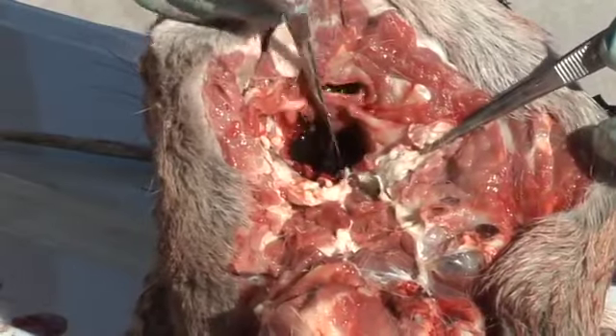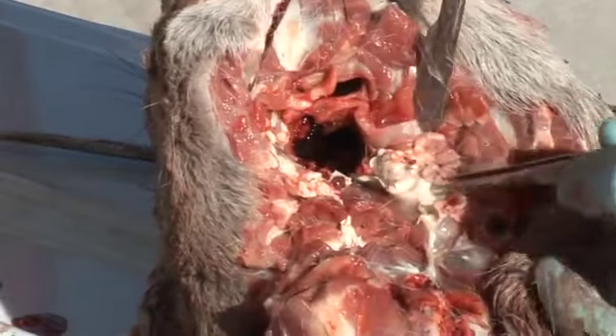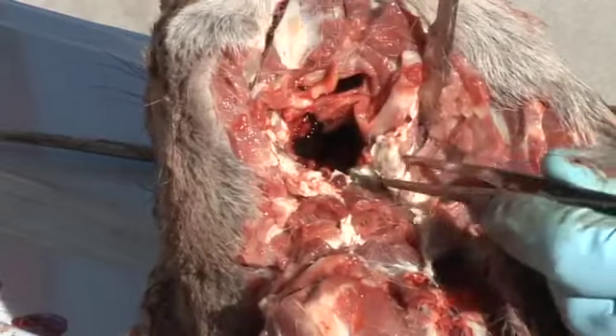Here's a second example. Notice here the lymph nodes aren't immediately visible at 5 and 7 o'clock of the oropharynx opening. An additional dissection is necessary.